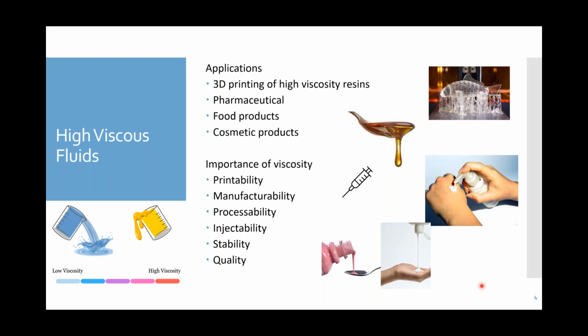Manufacturability of a product is highly dependent on the viscosity. Any fluidic system can be highly shear sensitive, and the structure can break down with the application of shear, as is the case, for example, during mixing or when pumped through pipes. So the flow behavior of products is important both during processing as well as for manufacturability.